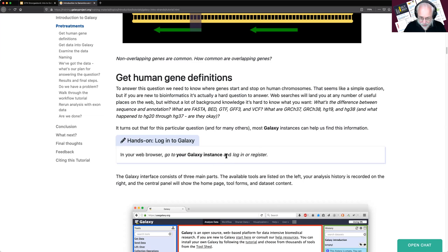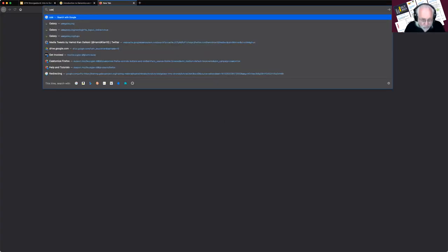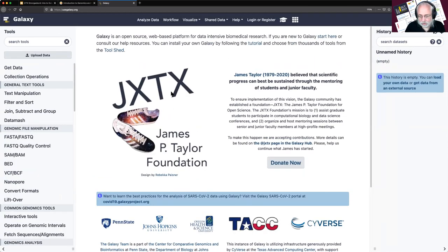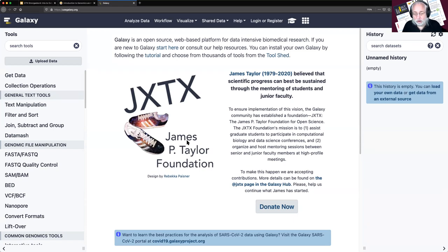First, we need to log in. Each of you should pick a Galaxy instance — the usegalaxy.star instances. This tutorial will work on all of those, and on most Galaxy instances because it's using pretty basic tools. I'm going to pick usegalaxy.org since I'm in the US. But you can pick whichever one you want. All the tools we need are available on all three of those.